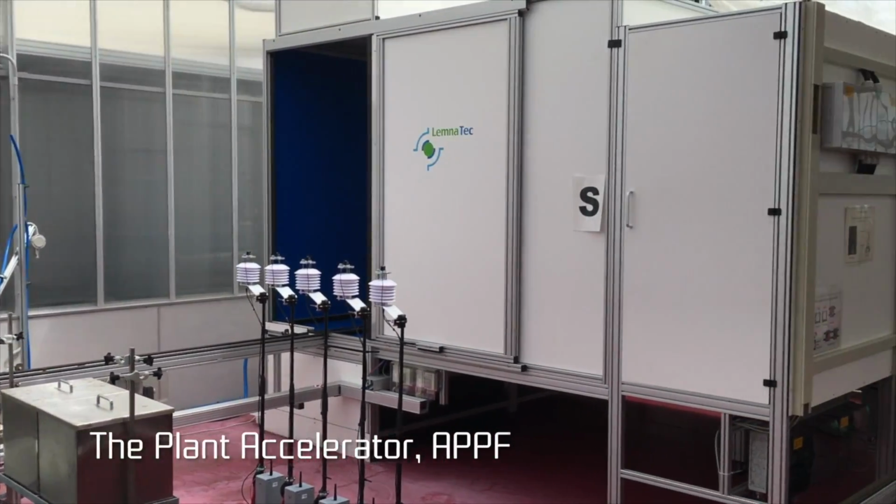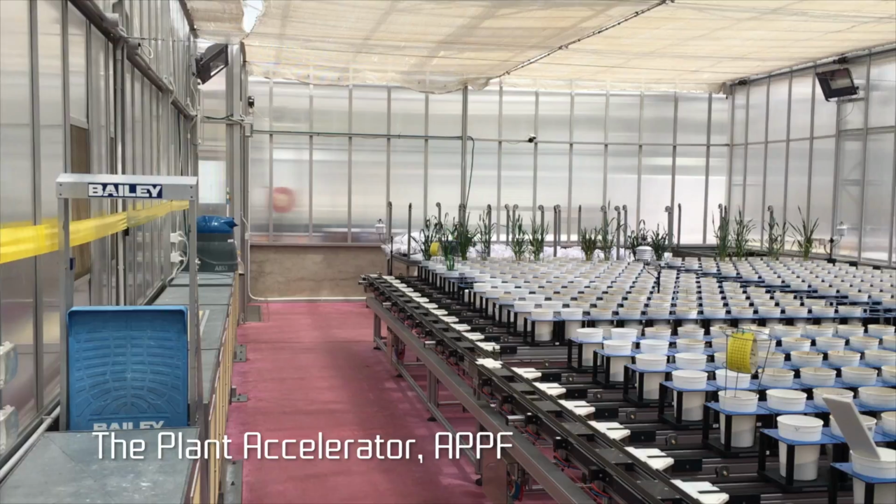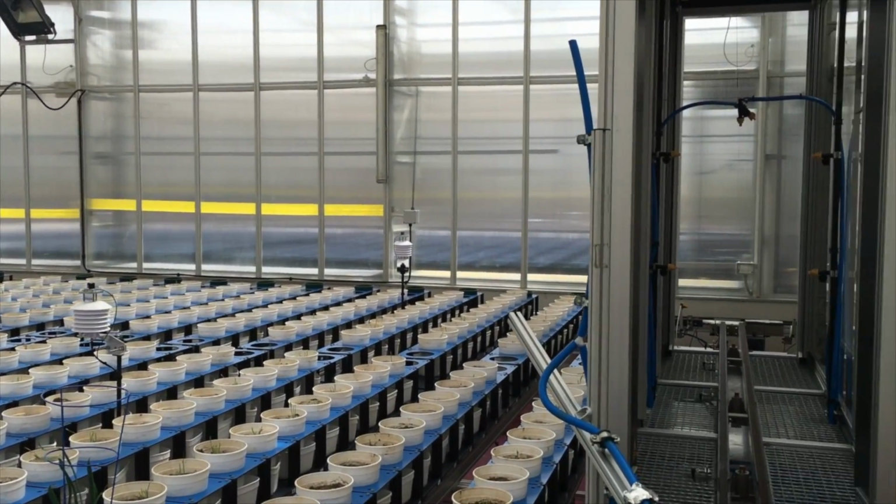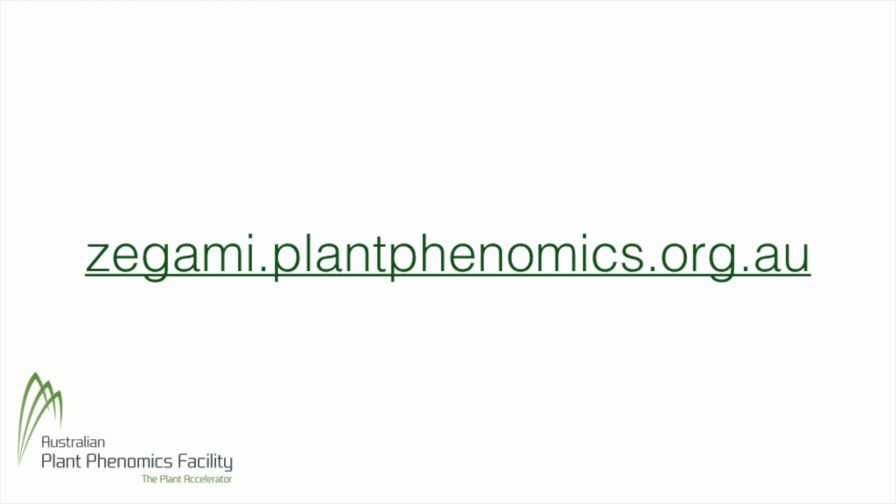Today I'm going to show you our exciting new web tool, Zegami. Let's start off with where to find it. Zegami can be found at zegami.plantphenomics.org.au or by following the link on the APPF website.